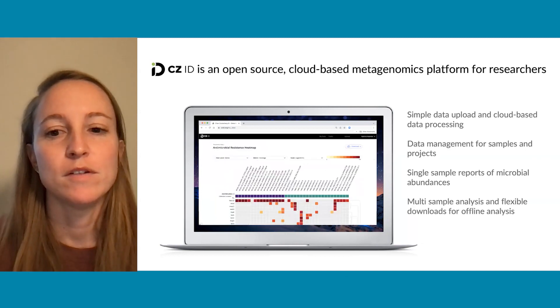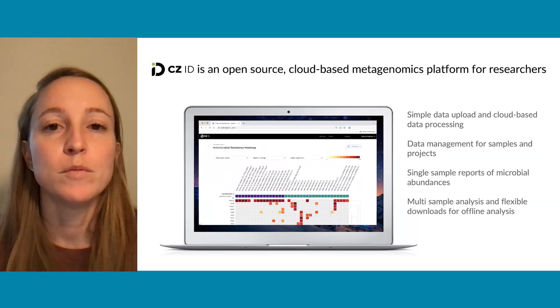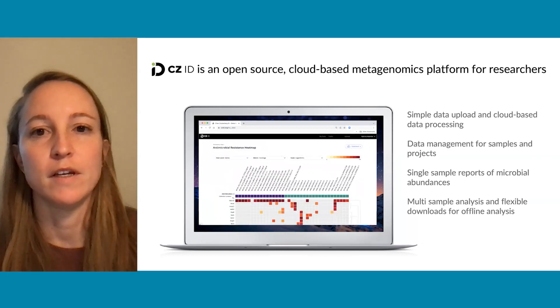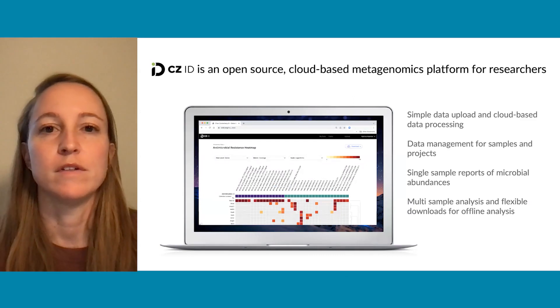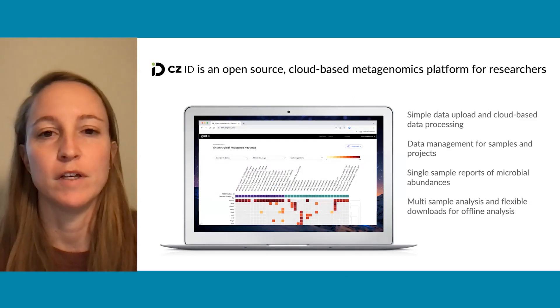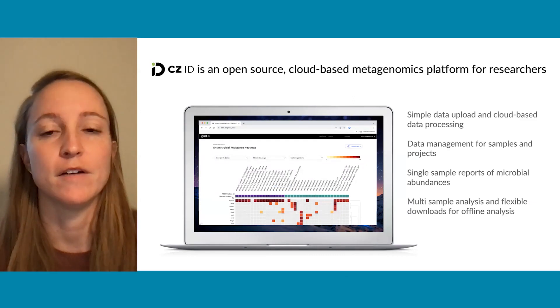It can then be used to look at multiple sample analysis across a cohort of samples, and there are flexible downloads available for offline analysis.